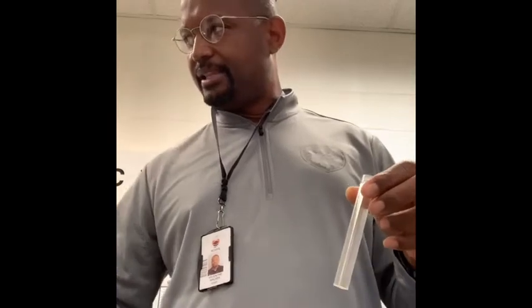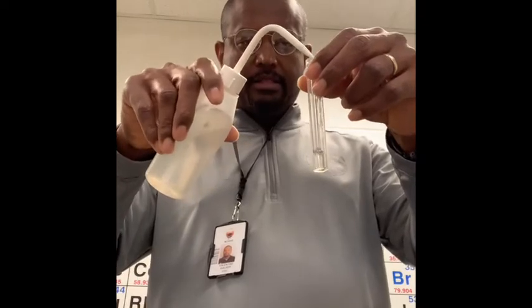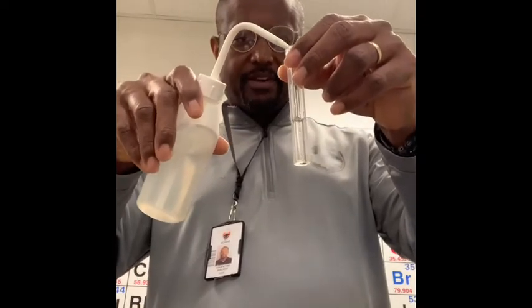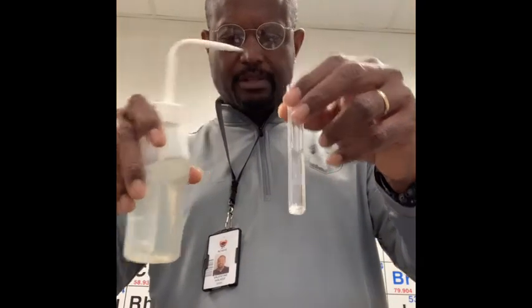So I have a vial here in my test kit. There's a line there that is marked 5 milliliter. I have my lake water that I've put in one of these old distilled water bottles, and I'm going to put 5 milliliters of water in there. This is my first step.